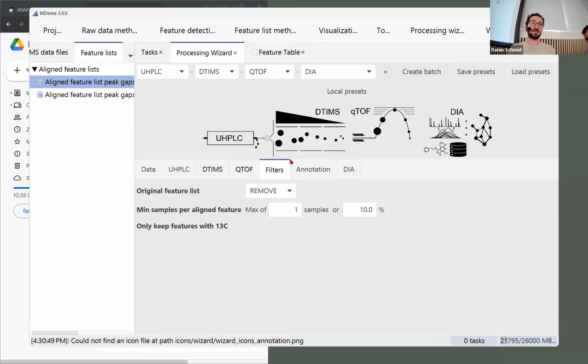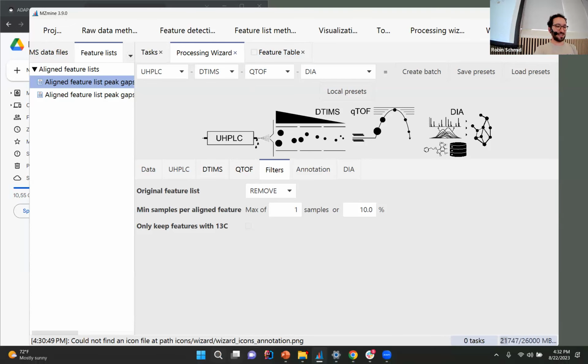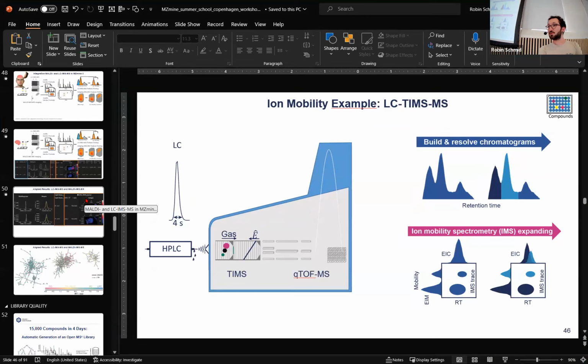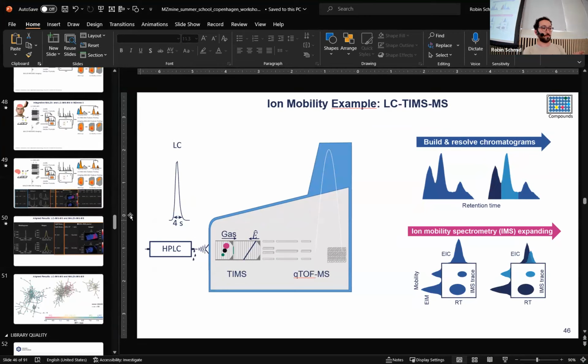Yeah, so just one thing, because we still have time, we also plan to show it, and we hope for having that time. We already mentioned it a couple of times, is the generation of reference data. Yeah. We're also going to share all those slides. So if someone feels like they're going to miss out, there's going to be the recording, and there's also going to be the slides that you can follow along.